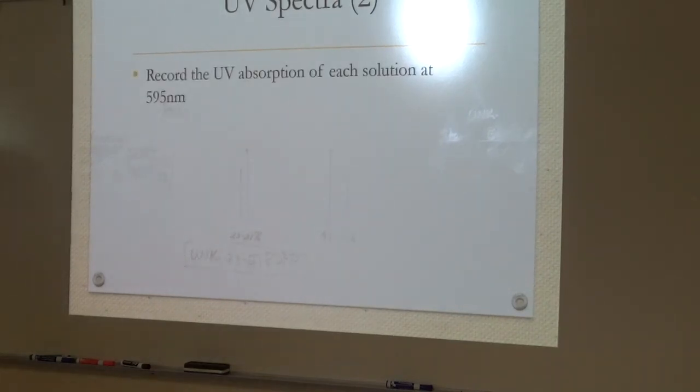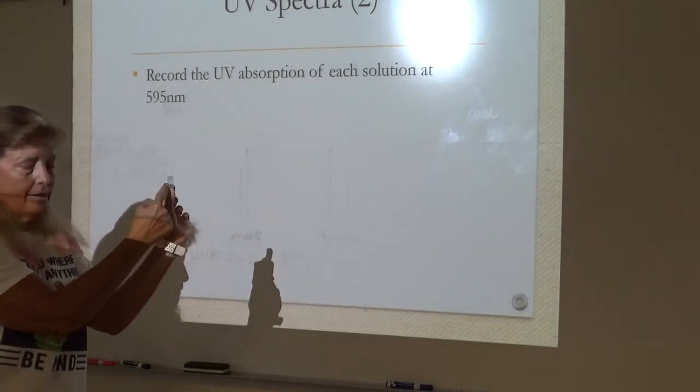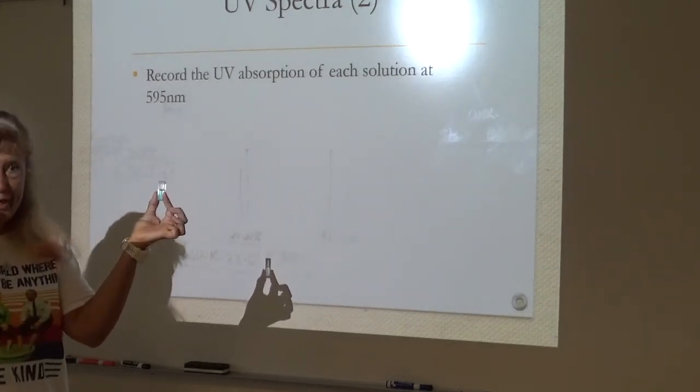This semester especially, we're going to have the spectrophotometers out for you. Hopefully they will all be calibrated, so that you only need to grab your cuvette. When you do that, make sure that you are holding the ground sides and that the clear sides remain free of fingerprints.